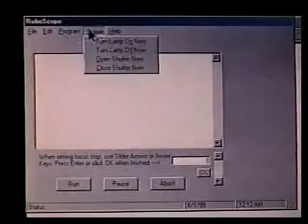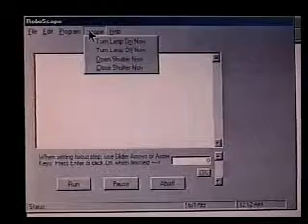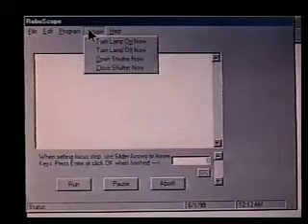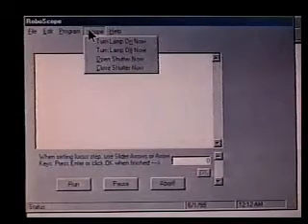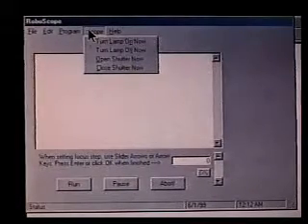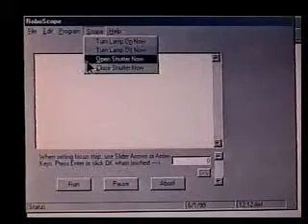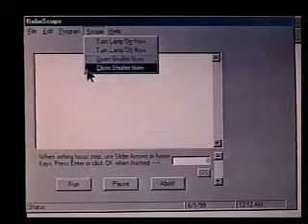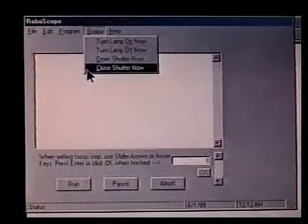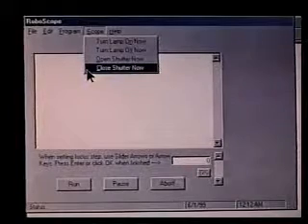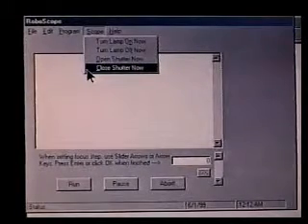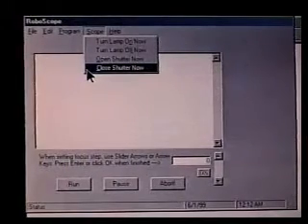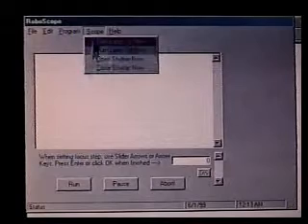And the Scope menu lets you immediately affect microscope functions, like turning the lamp on, off, opening the shutter, and closing the shutter, not as part of the program, but immediately, so that you can manipulate the microscope in the process of writing the program if you need to.